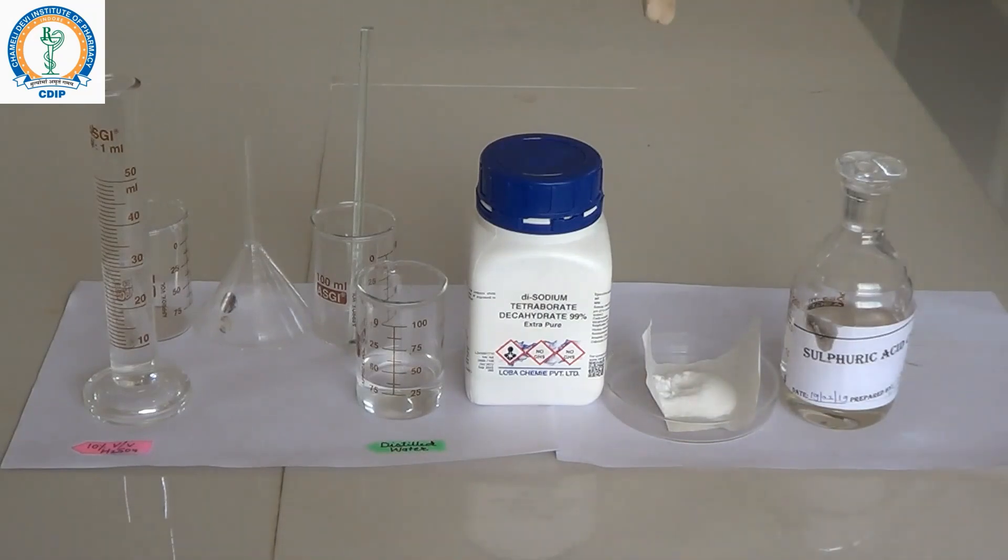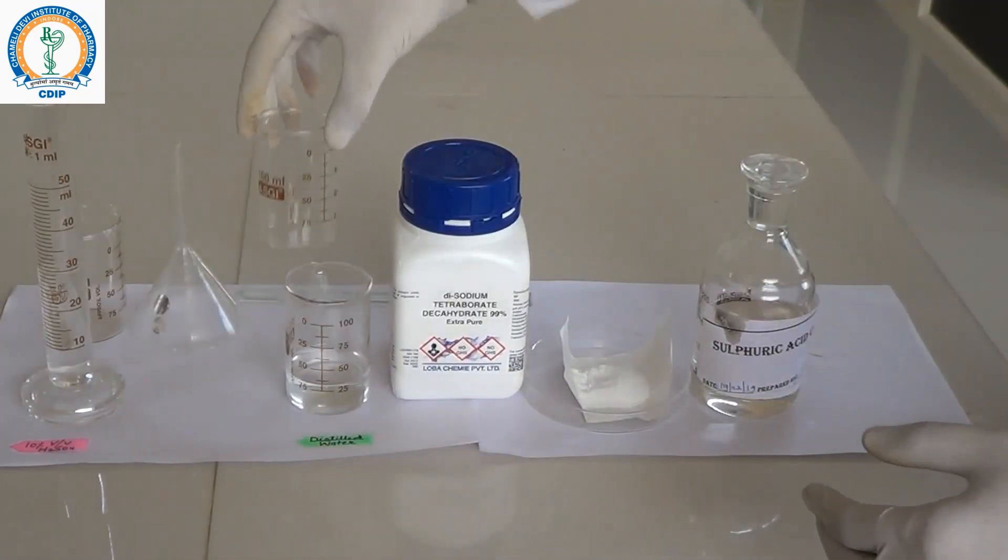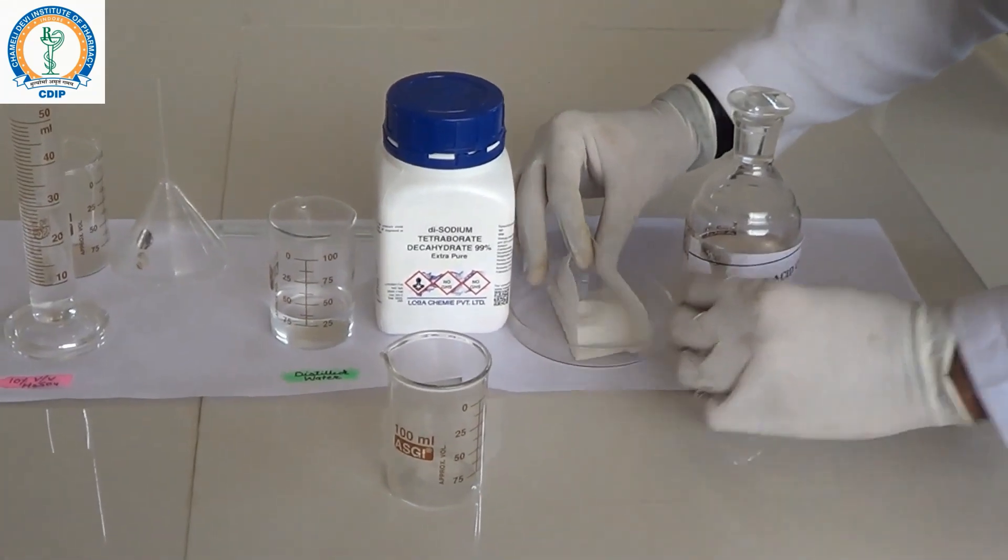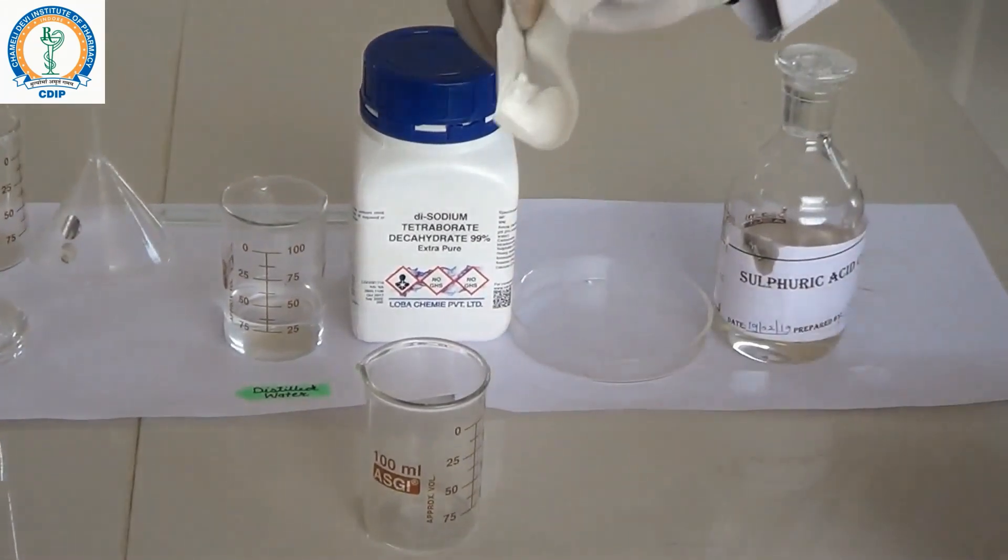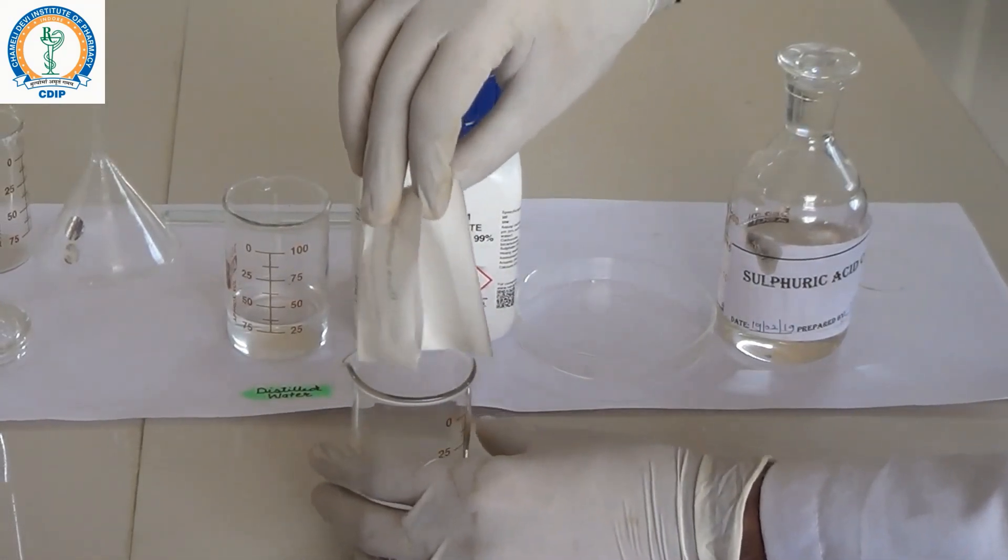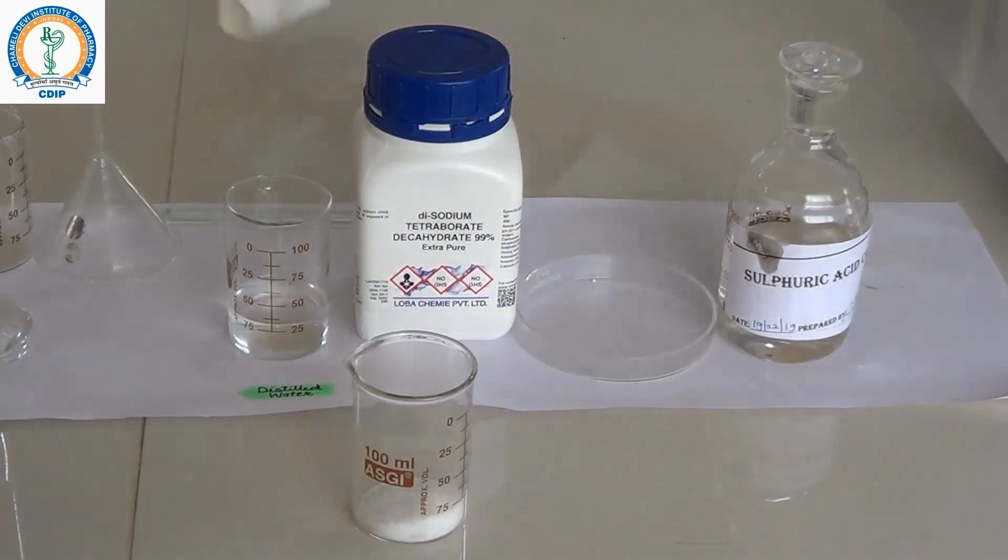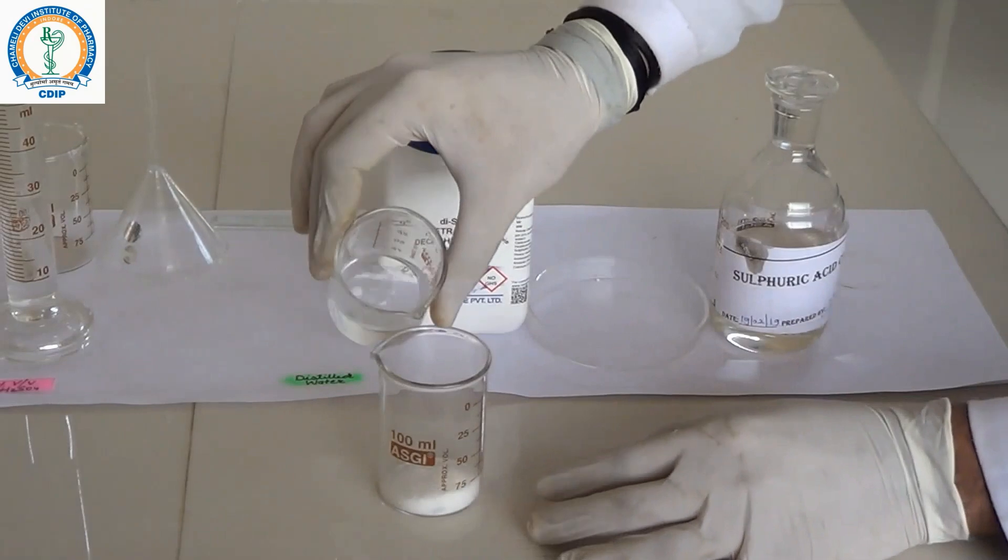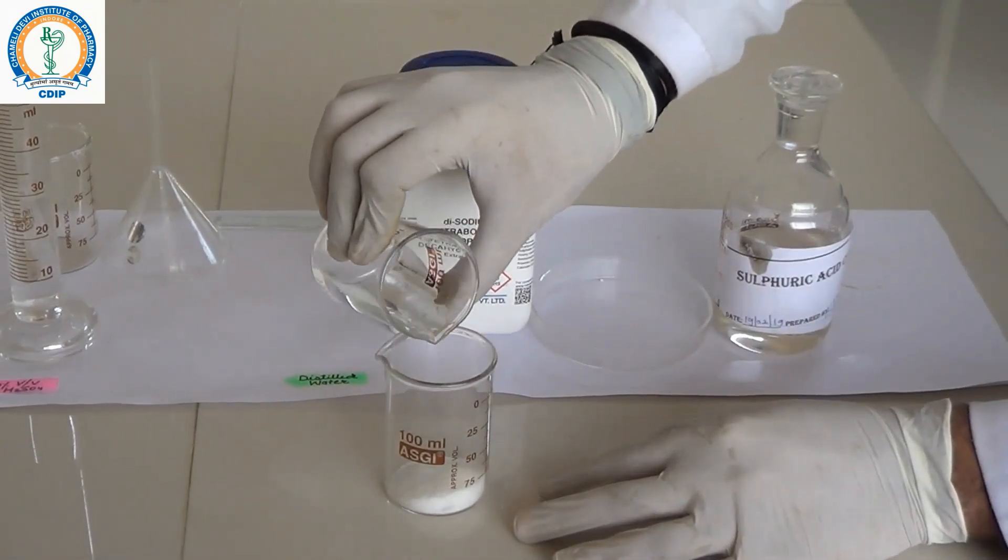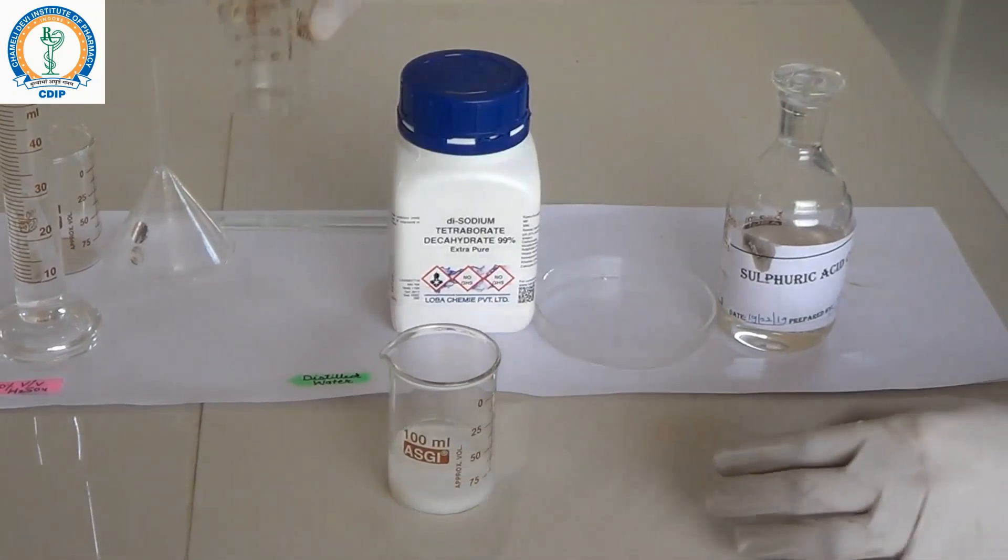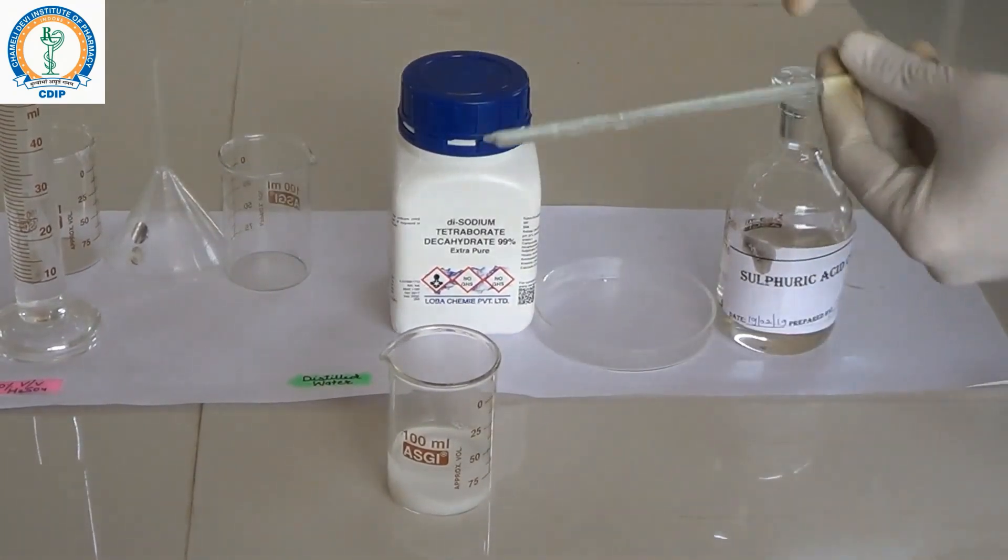For the preparation of boric acid, first of all we will transfer this borax into the beaker. Now add distilled water to it and mix the solution using a glass rod thoroughly.